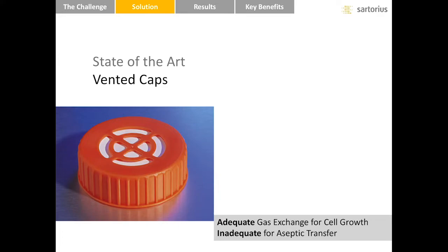This is the cap of the typical Erlenmeyer shake flask used today. These caps have an embedded vent filter, which occupies the entire surface area of the cap, leaving no room for tubing. Cells in a culture consume oxygen and produce carbon dioxide. Cultures starved of oxygen will not grow. Cultures with too much carbon dioxide become acidic and disrupt cell growth. Gas exchange across the filter membrane is the critical attribute to a successful cell expansion. Because airflow in an incubator is passive, there must be unrestricted airflow across the entire filter membrane to support cell growth.